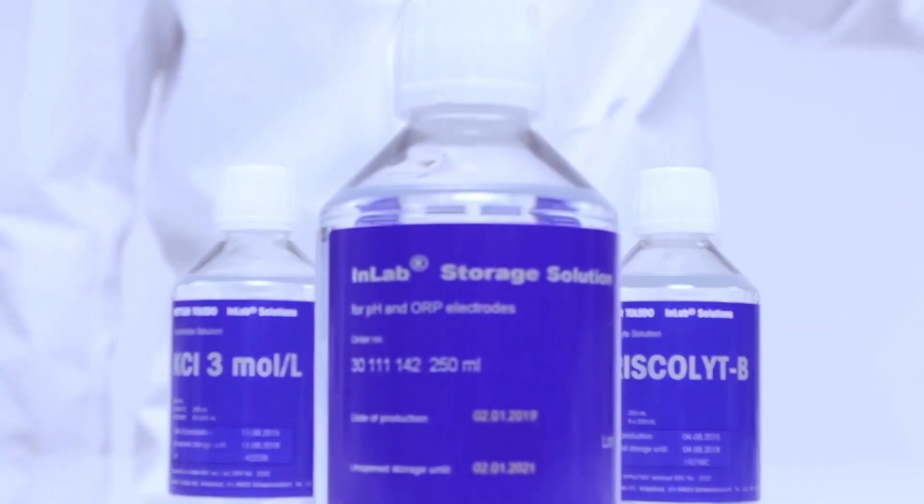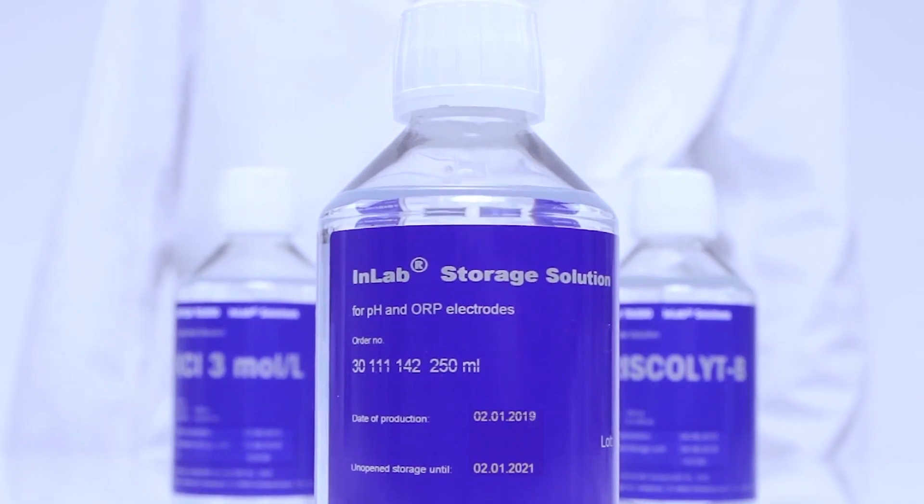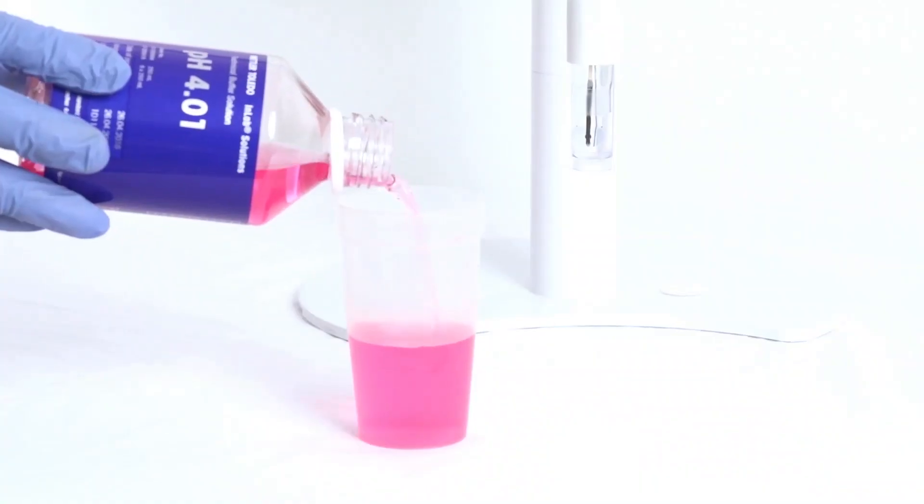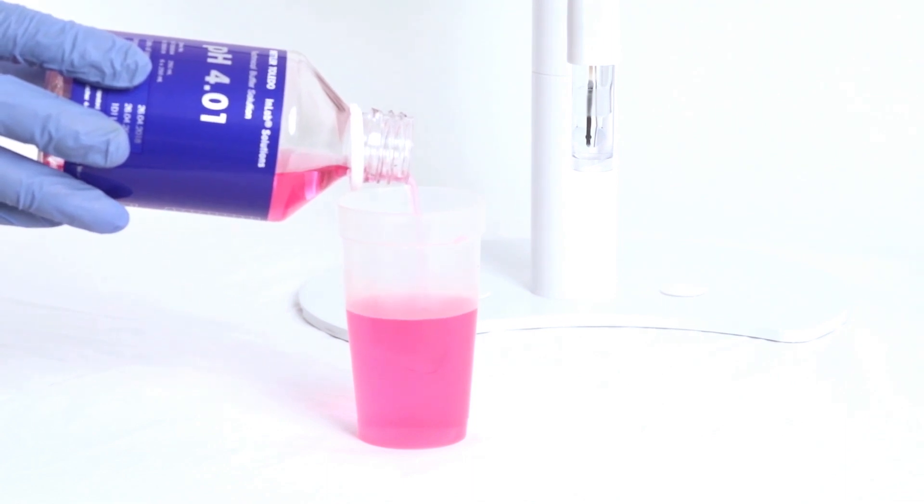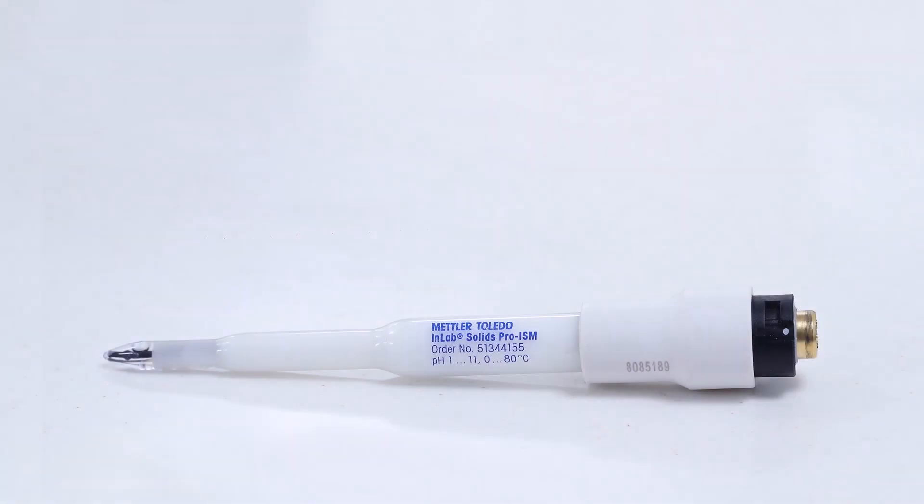Store the electrode in InLab storage solution when not in use. Ensure use of correct buffers in the correct sequence. Always use fresh buffers. Check the expiry date. The pH range for InLab Solids Pro-ISM is 1 to 11 pH units.